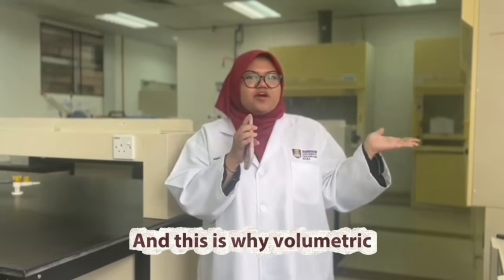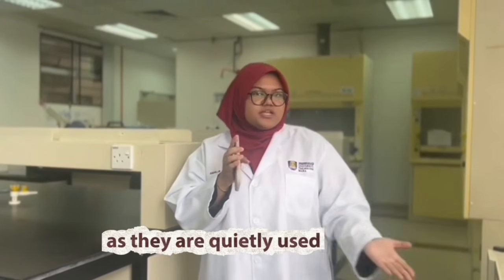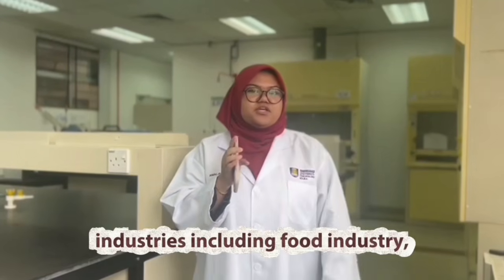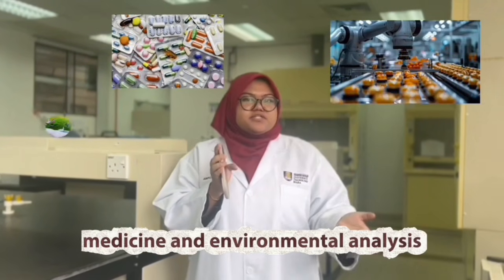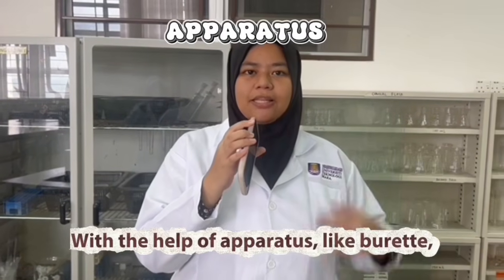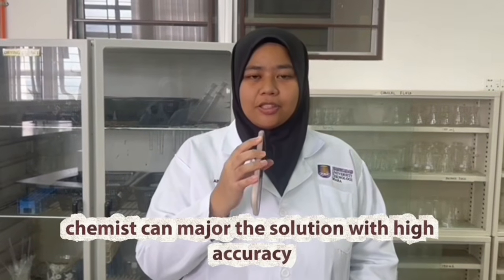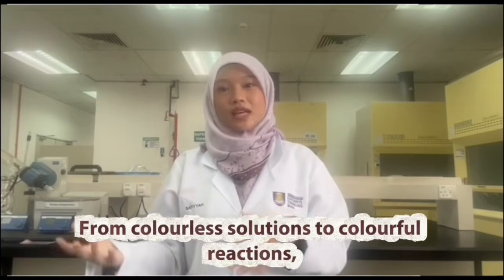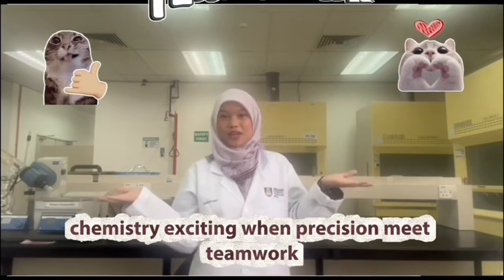And this is why volumetric analysis is very important in our life, as it is widely used in many industries, including food industry, medicine, and environmental analysis. With the help of apparatus like burette, pipette, and conical flask, chemists can measure the solution with high accuracy. From colorless solution to colorful reactions, chemistry is exciting when precision meets teamwork.